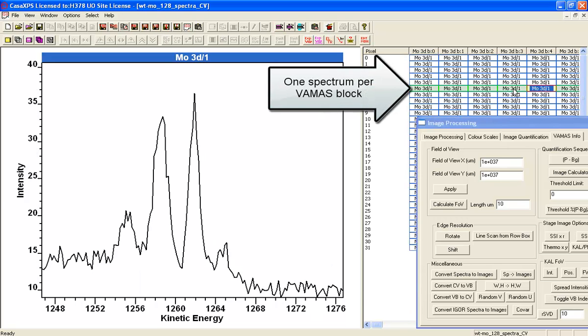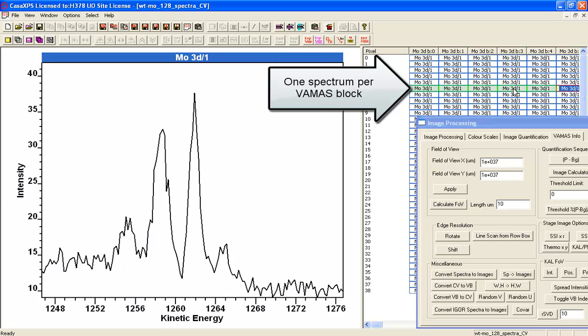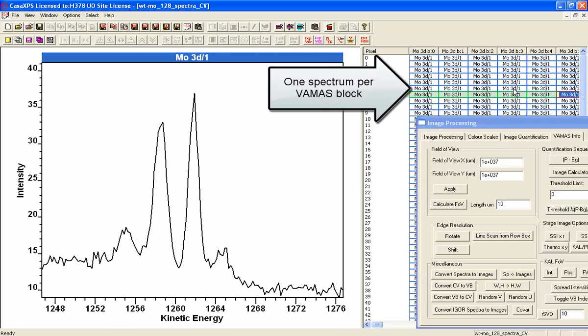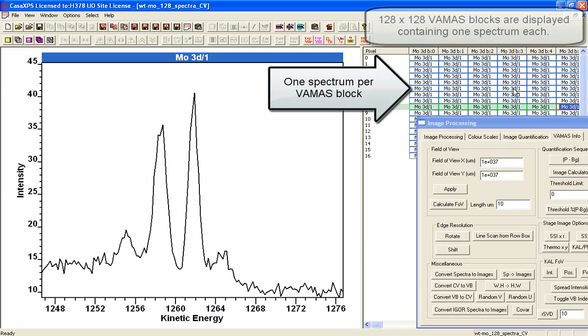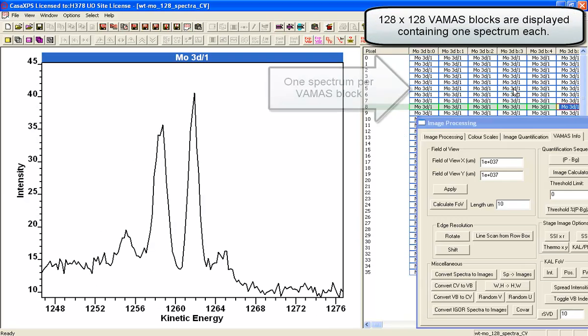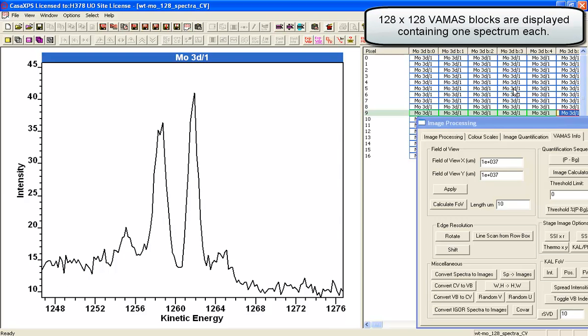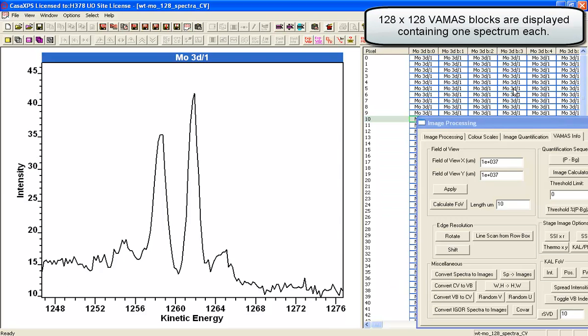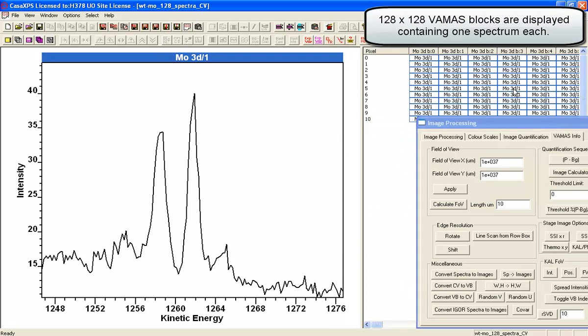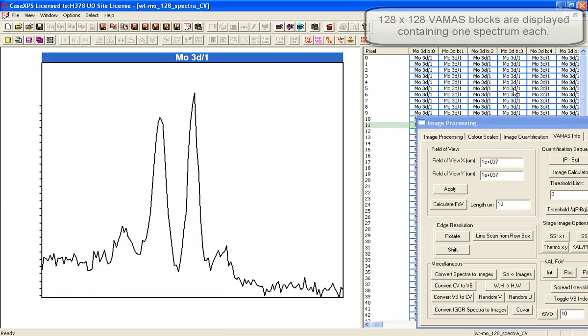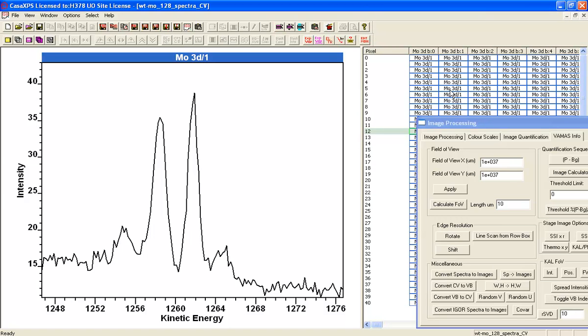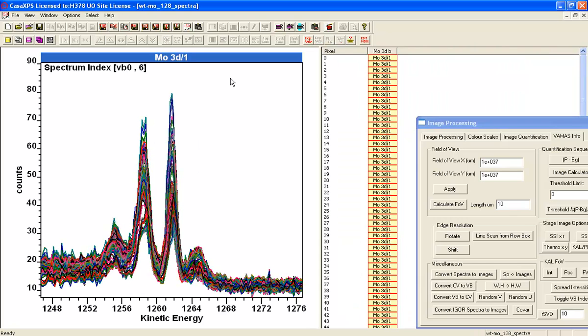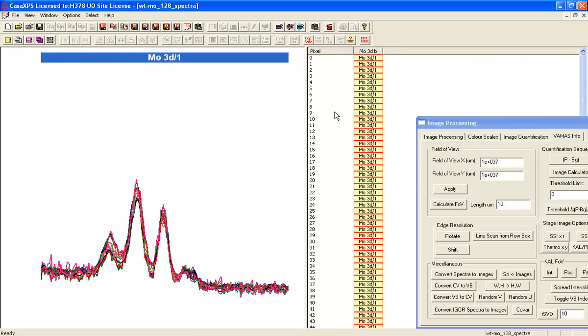I can move around and you can see that although they are not perfect spectra, we've got 16,000 spectra that are showing us the relationship between the molybdenum disulfide and the molybdenum oxide that's on the surface. So I'll close that because that was just to illustrate the number of spectra that are genuinely underlying these measurements.